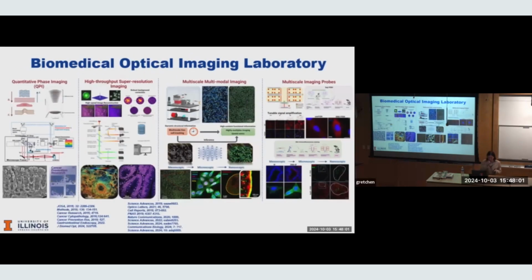My lab has several general directions. We work both on quantitative phase imaging and high throughput super resolution microscopy. More recently, we started working on cross-scale, multi-scale approaches that connect label-free refractive index changes of the tissue with the molecular scale information that you get from super resolution imaging.